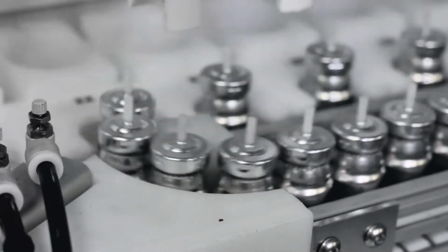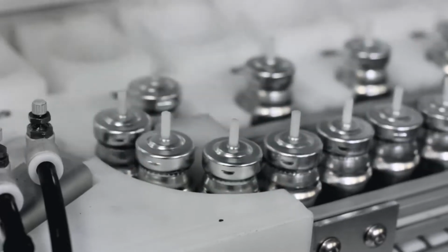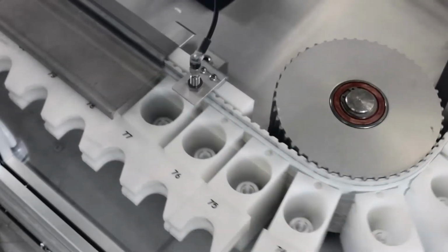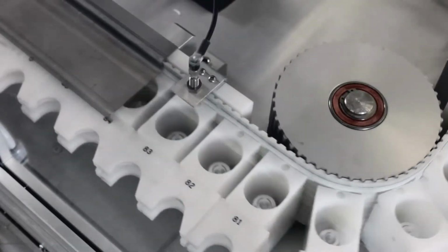The client wanted to move towards 100% testing of all cans being manufactured. We felt that we needed a puck system whereby the MDI is contained totally within the puck, and that puck retains all of the gas leakage. The gas is heavier than air, so it goes towards the bottom of the puck to give the instrument the maximum amount possible of gas leakage. And we are talking here of micrograms of leakage.